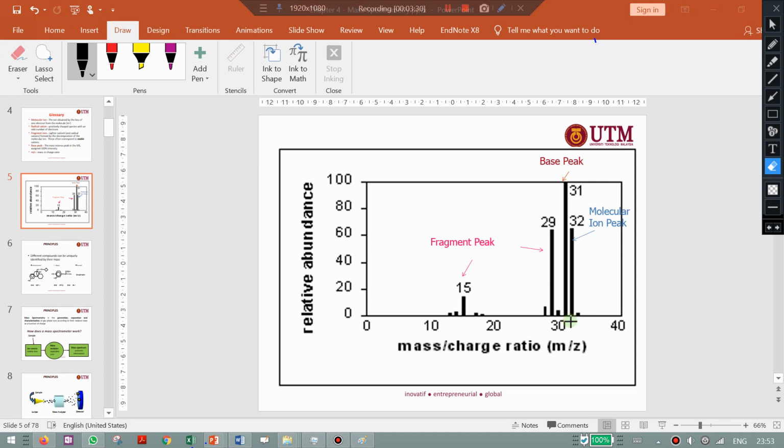Okay, maksudnya tadi yang ni semua fragment ion tu yang akan spread dekat you punya mass analyzer. Dekat column dia akan spread compound saja, but in the mass analyzer you akan spread you punya fragment ions or you punya molecular ion lah sekali. Okay, ingat alright, better I draw lain kali dekat ni lah, dekat PowerPoint, so I can refer back.